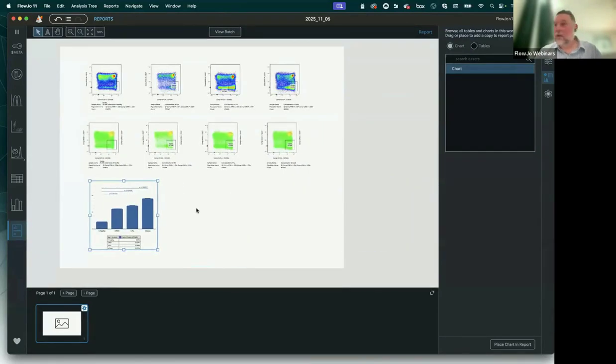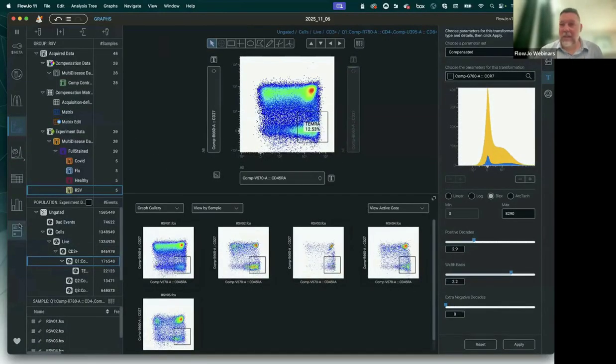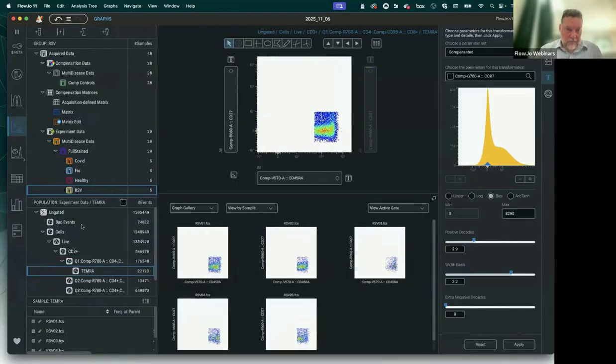I realize I didn't show histogram overlays, but I'll do a quick one for you guys, and then I'm going to have to call it for today because I'm classic at going over time with demos. I'm going to check your chat questions here as well. So here I've got some, yeah, I'm just going to make an overlay and show you the histogram options real quick.